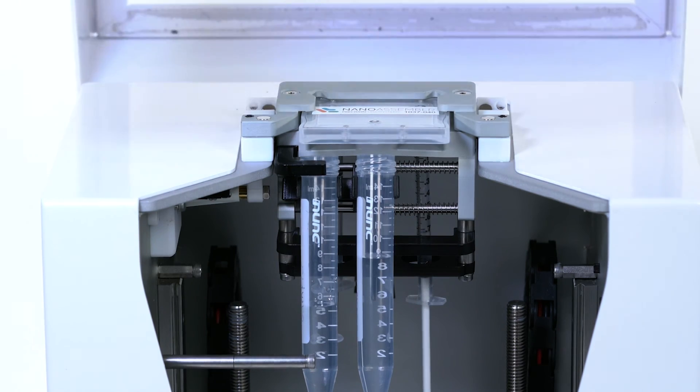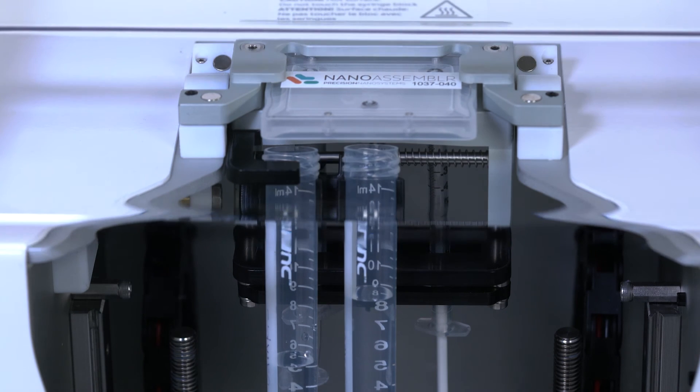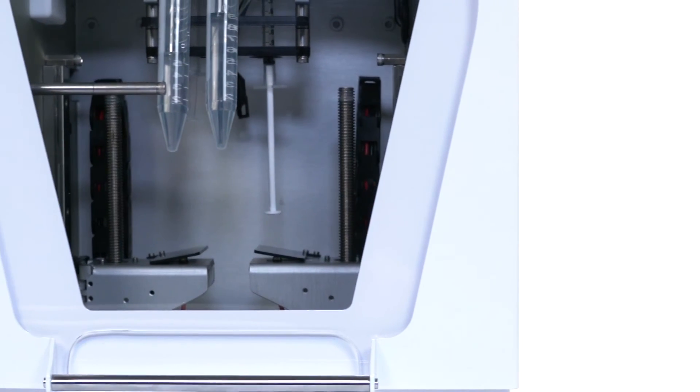The broad applicability suddenly increases the access to researchers to find a nanoparticle or a nanomedicine that solves their need.